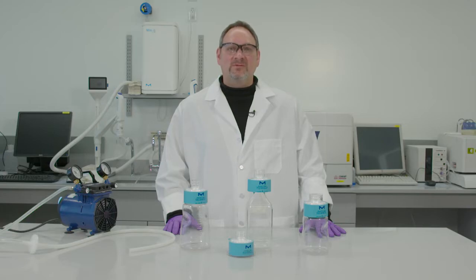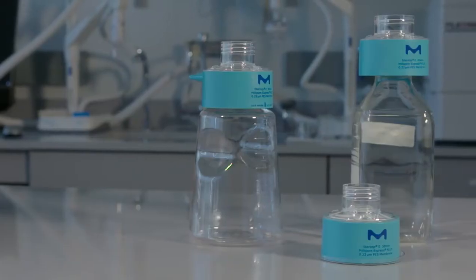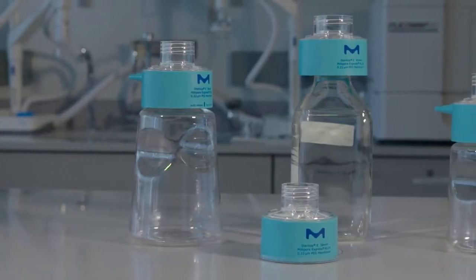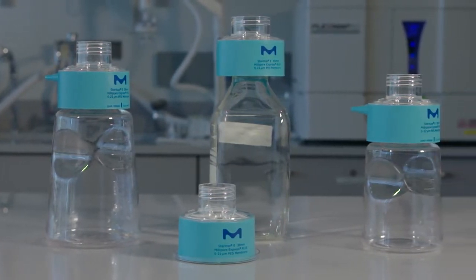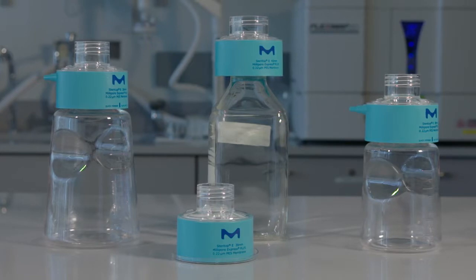and which bottles are compatible with which formats. The SteriCup E and SteriTOP E systems are funnel-less filter products for use in the sterile vacuum filtration of tissue culture media and buffers.